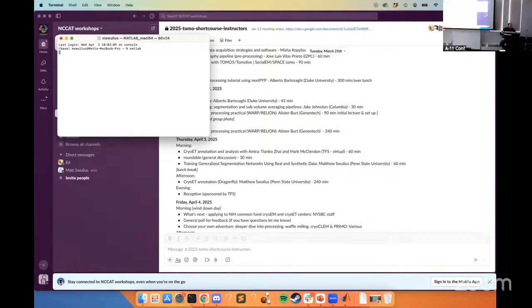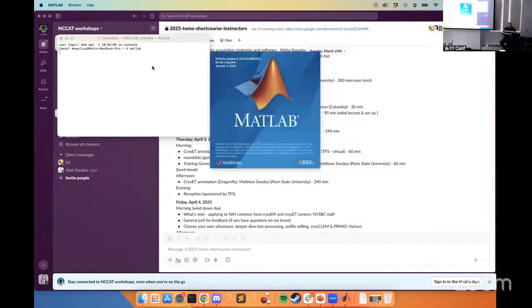I have a thing for commercially available software. My brothers are both software engineers, and open source software, I love it. I use it all the time, but it's a pain, right? And for segmentation you need some very specific kinds of tools. That's why I like Dragonfly. I'm not going to code all of the kinds of tools that exist in Dragonfly.